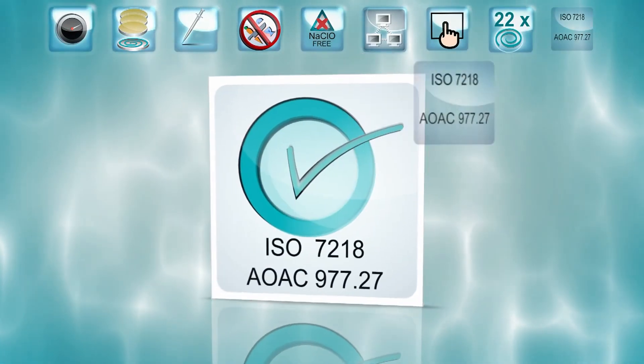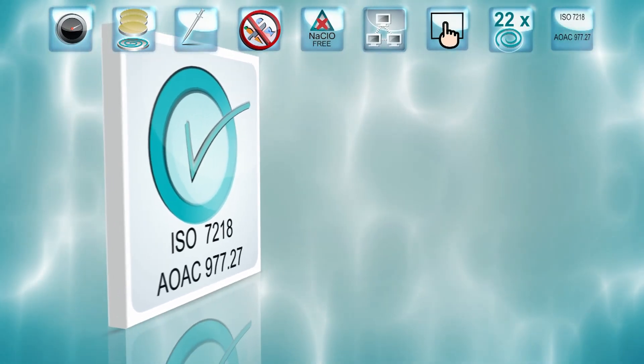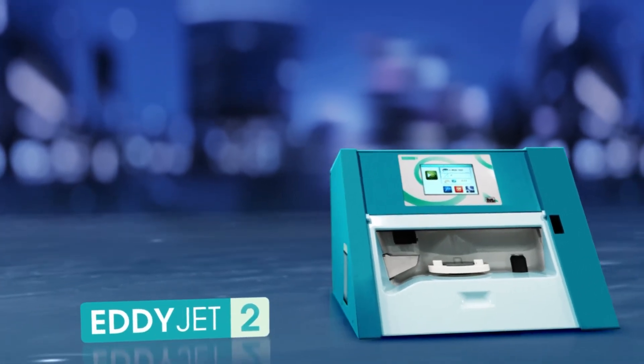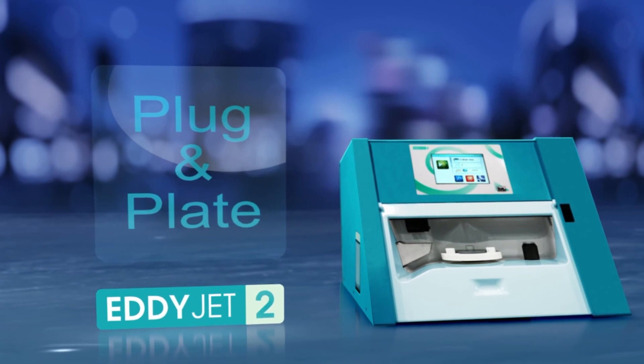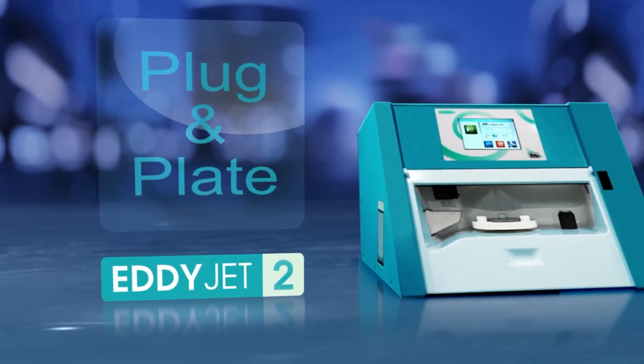Spiral plating is an ISO and AOAC validated microbiological method. A streamlined workflow, user-friendliness, and speed make Eddy Jet 2 the most productive spiral plater.